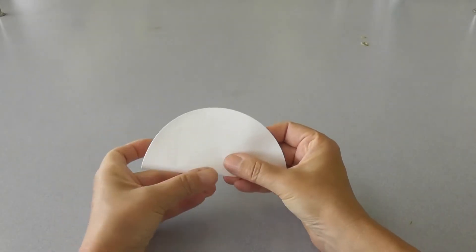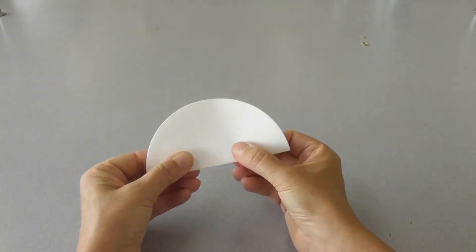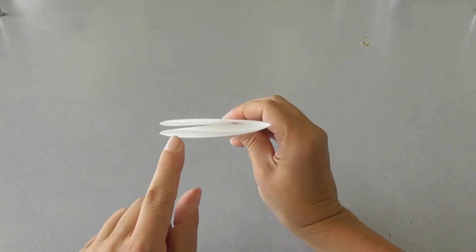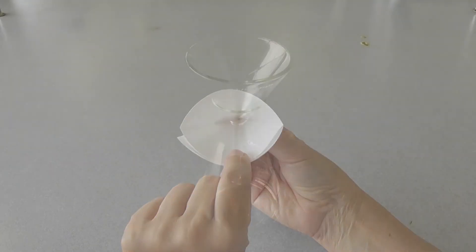If using regular filter paper, fold it in half and then in half again. Open up one of the folds, creating a cone and place this cone into the funnel.